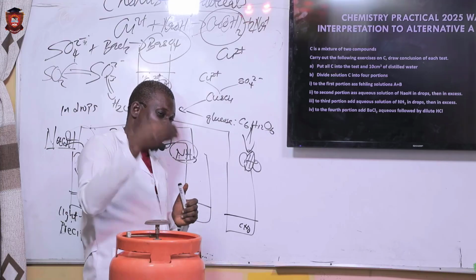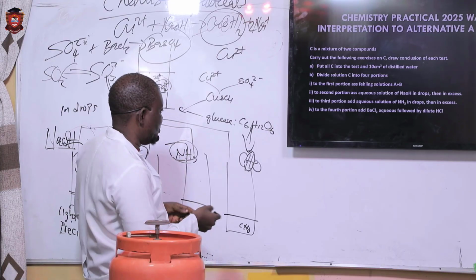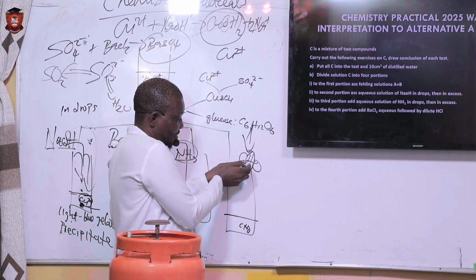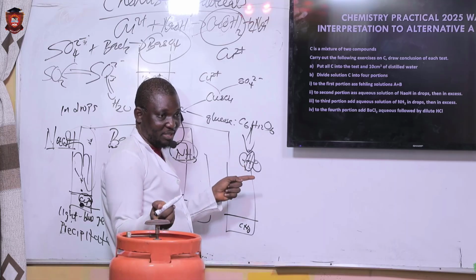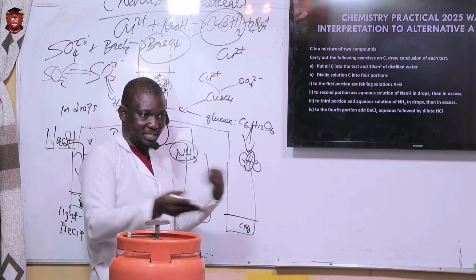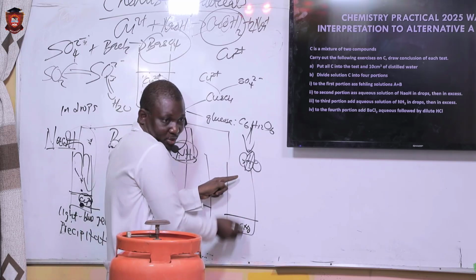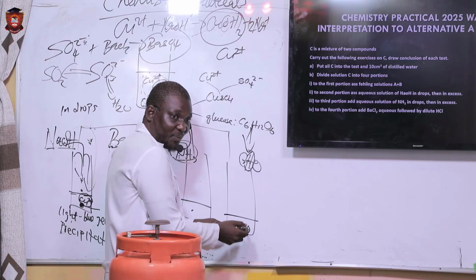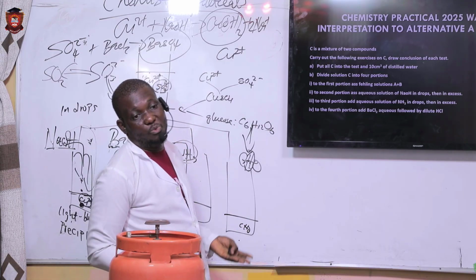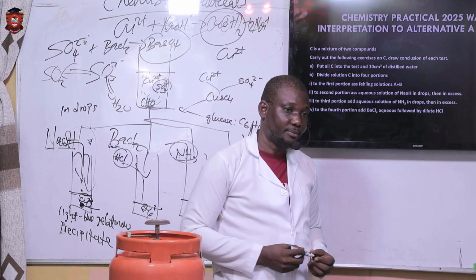Then we warm. We need high activation energy for glucose to be what? Present. You know, most organic compounds, their reactions are very slow. We need to heat so that the bonds will break here. That's why we are warming. They are not like normal inorganic reactions where ions will react instantaneously. If you want this reaction to be positive, after adding Fehling's solutions A and B, you must what? Warm. If you didn't warm, you will not see any red precipitate color that is like this.